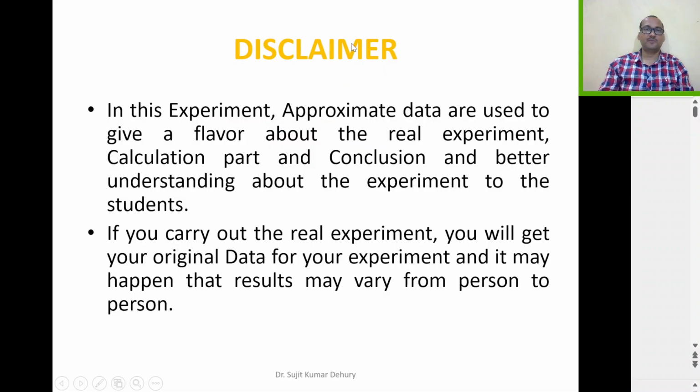So there is a disclaimer for this experiment. In this experiment, approximate data are used to give a flavor about the real experiment, calculation part and conclusion, and better understanding about the experiment. If you carry out your own experiment, you will get your own original data, and it may happen that the result may vary from person to person.